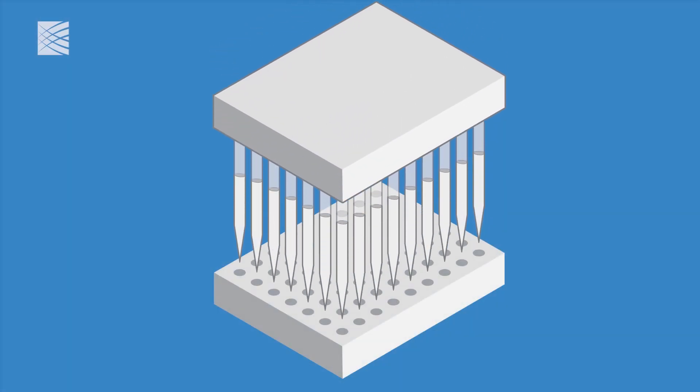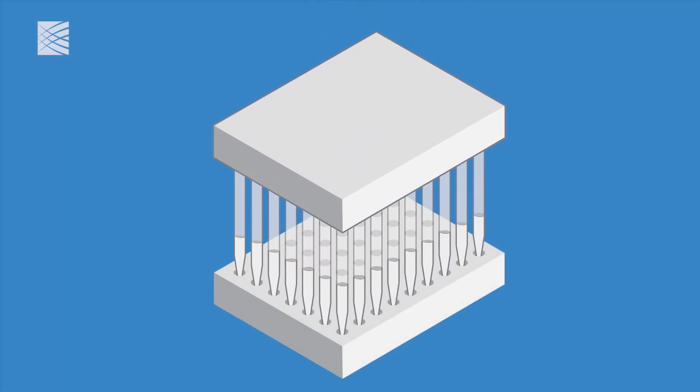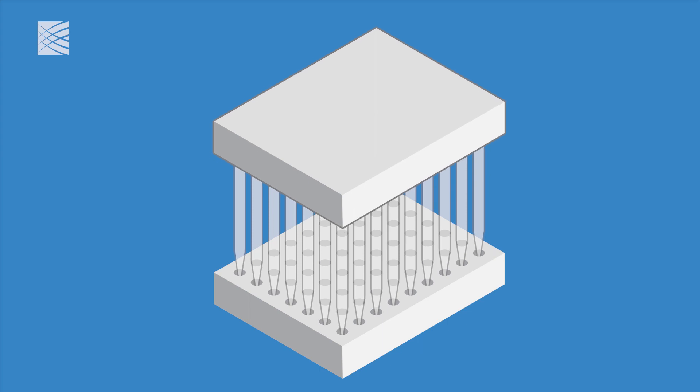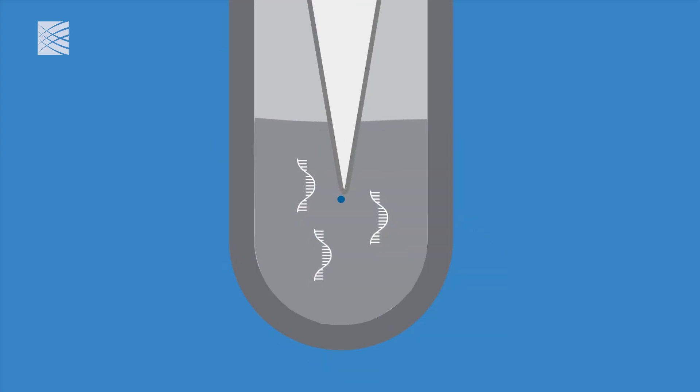Another machine transfers the samples from individual tubes to high-capacity trays so that many samples can be analyzed at the same time. An extraction machine uses small magnetic beads to capture all RNA in the samples.